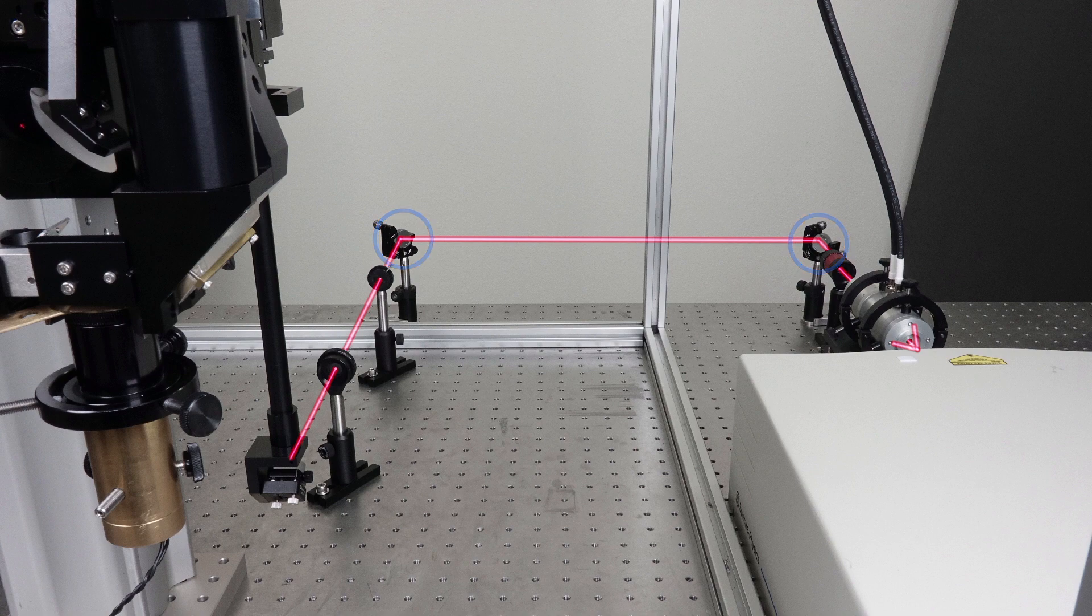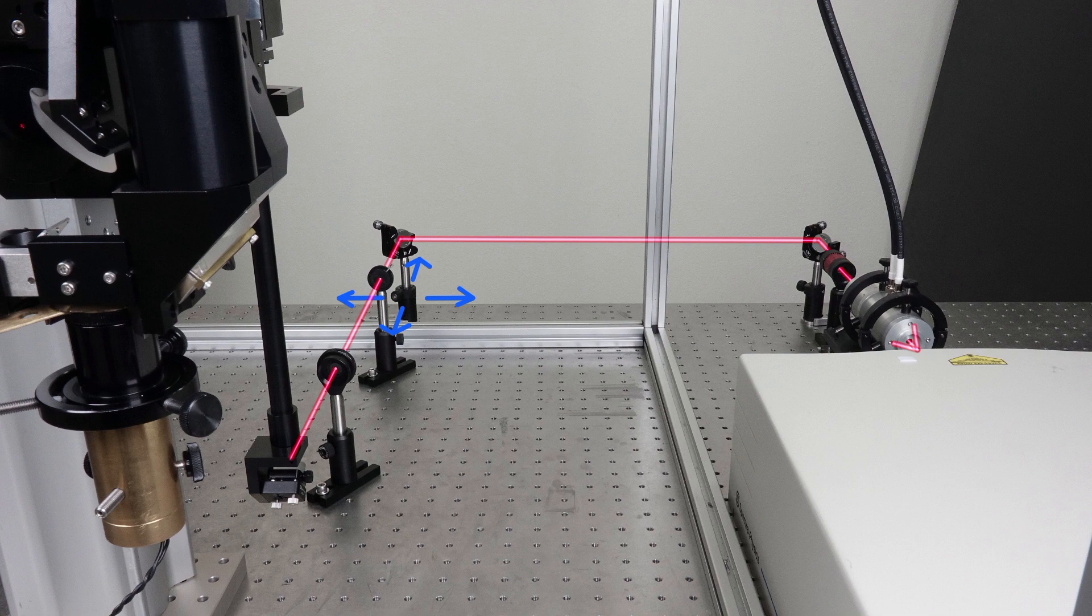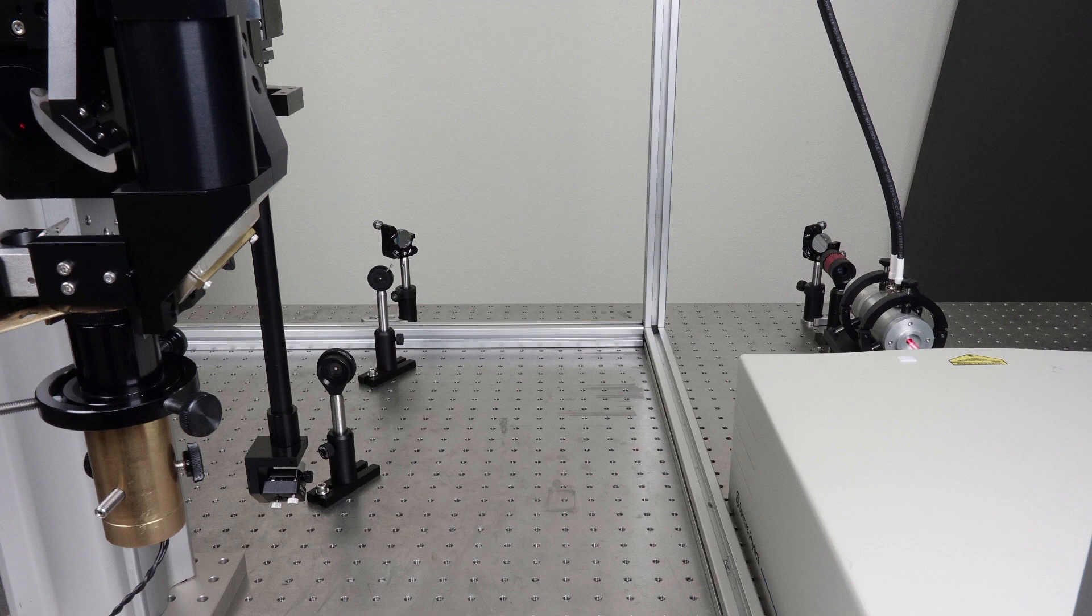I like to use this as my opportunity to reposition any mirrors necessary by aligning the beam backwards towards the imaging laser. This will get my imaging beam closer to the target when we switch over to the imaging laser and work it back through the microscope.